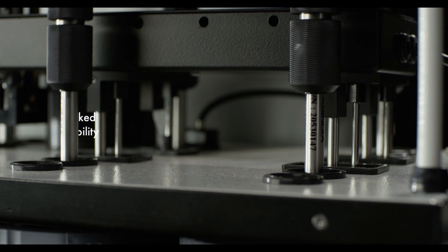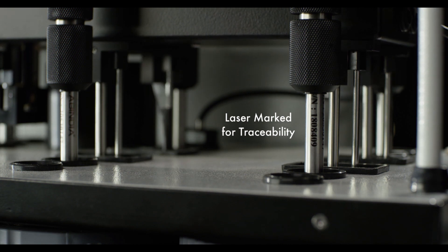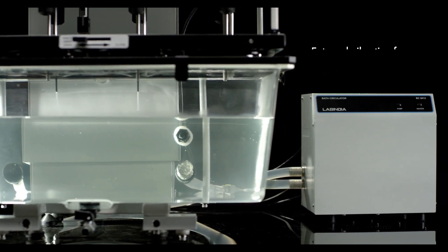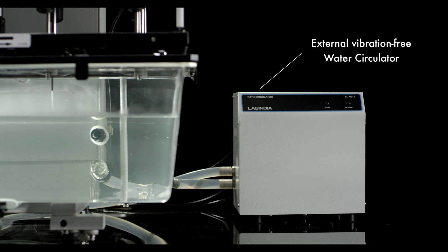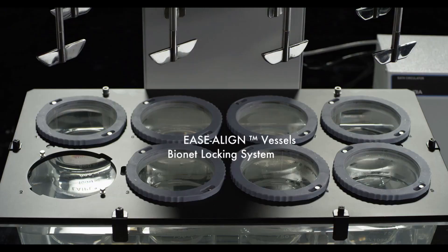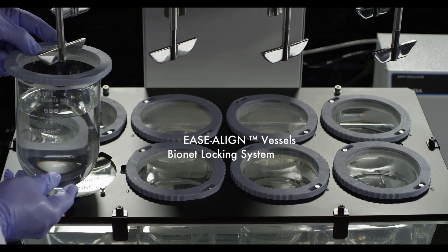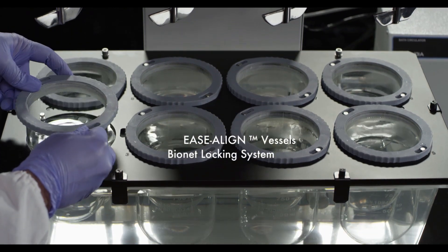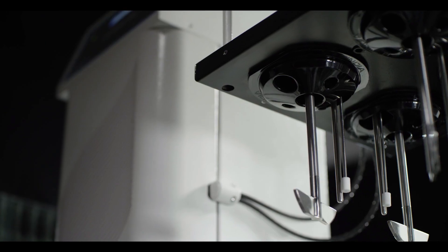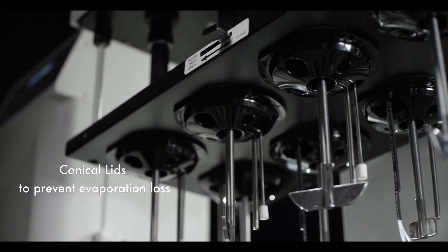All shafts, paddles, and baskets are laser marked with serial number for traceability. The easy placement ensures vessel centering and bionet locking do not allow floating of vessels even when empty. The conical shape low evaporation recovery lids reduce media loss during long runs.